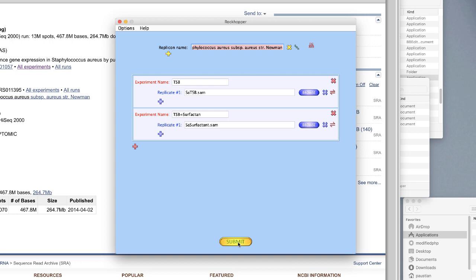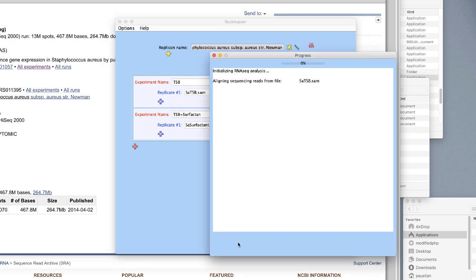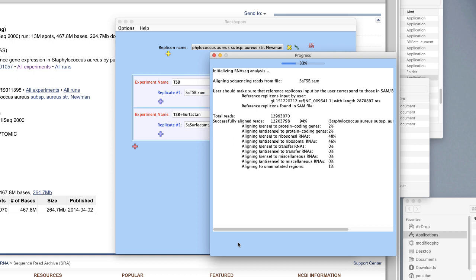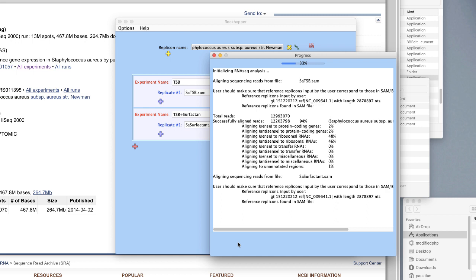And now we're ready. You hit Submit and it goes through, taking out all the RNA-seq data. It's making sure it's fine and it's going to start comparing it to that replicon — the Staph aureus subspecies aureus strain Newman replicon.